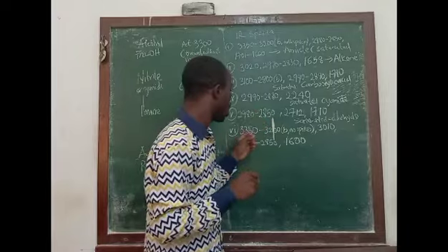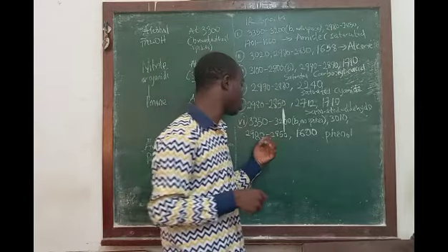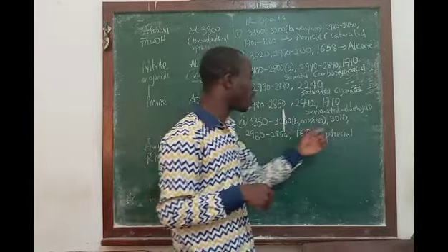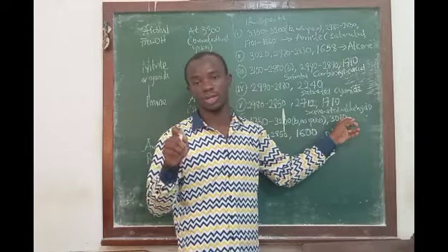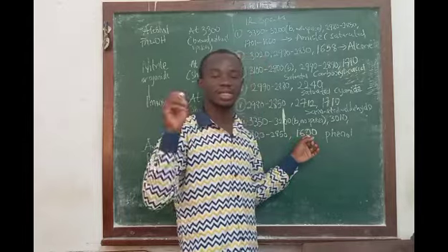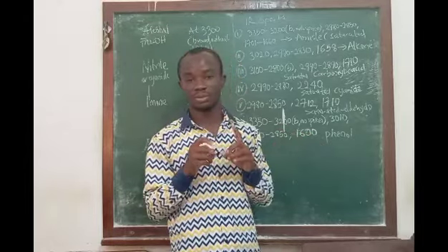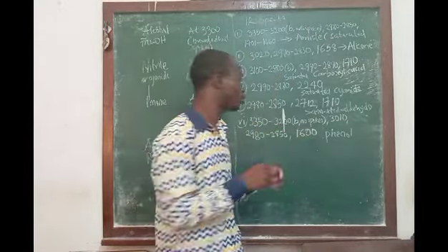For the sixth spectrum in these examples, the first thing we see is a signal just below 3000, which represents saturated carbon in the compound. We also have a signal just above 3000, which represents the sp2 C-H stretching vibration. That means the compound also contains a double bond. We also have a signal at exactly 1600, which represents C double bond C in an aromatic ring. So this spectrum is for an aromatic compound.